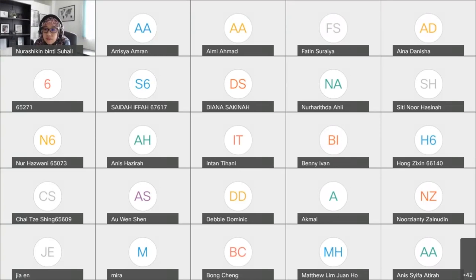Does the baffle also affect the shear force of the agitation? Yes, because the baffle is to improve the mixing. The agitator is the one in the middle, right? The baffle is the one at the side. It sits very close to the edge of the vessel. If we talk about the engineering, the dynamics of the fluid, if it only relies on the impeller, now I'm talking about a stirred tank reactor, the one that rotates in the middle, then without a baffle there will be a dead zone near the edge of the vessel.